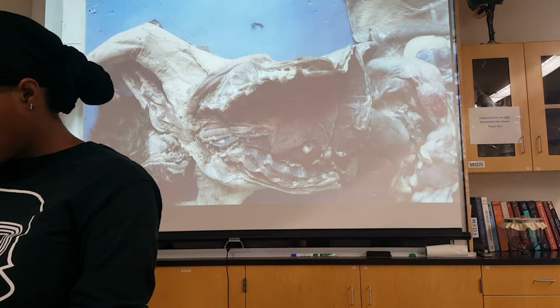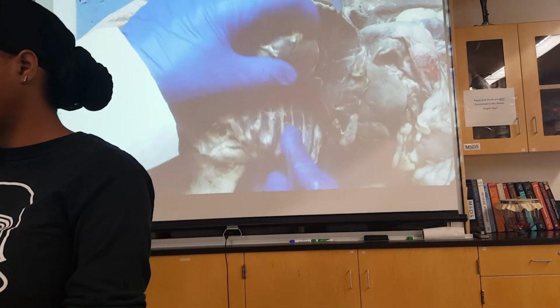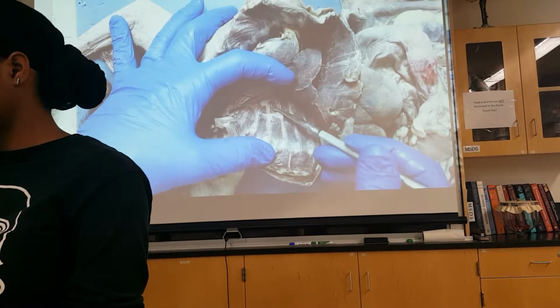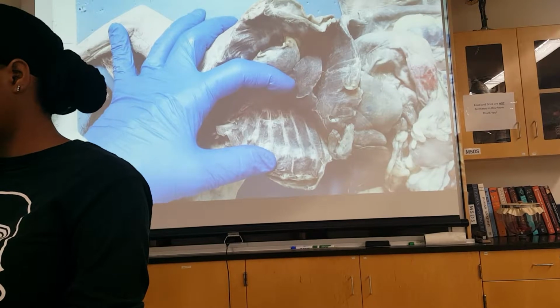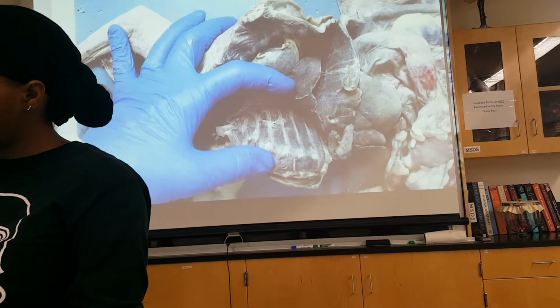And I think so we've got those. And then there are nerves here. And the nerves, we did these as well. The nerves are here, posterior intercostal nerves. So every rib space has an artery, a vein, and a nerve. And if they were colored right, you'd see red, white, and blue alongside each and every rib.